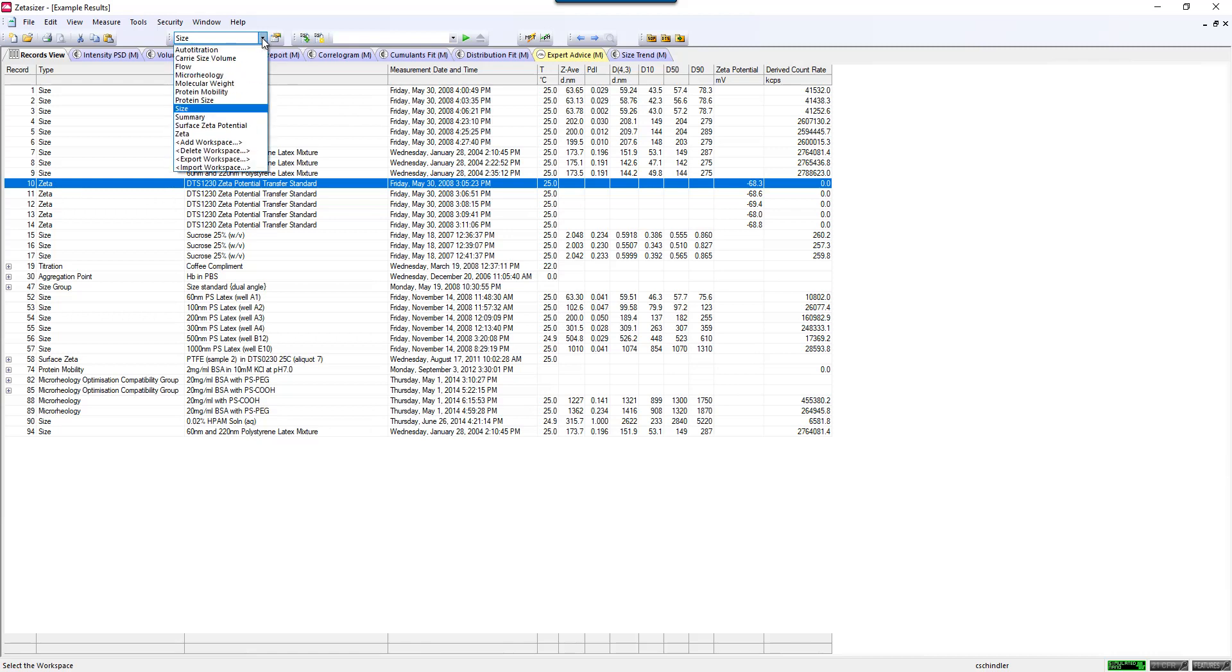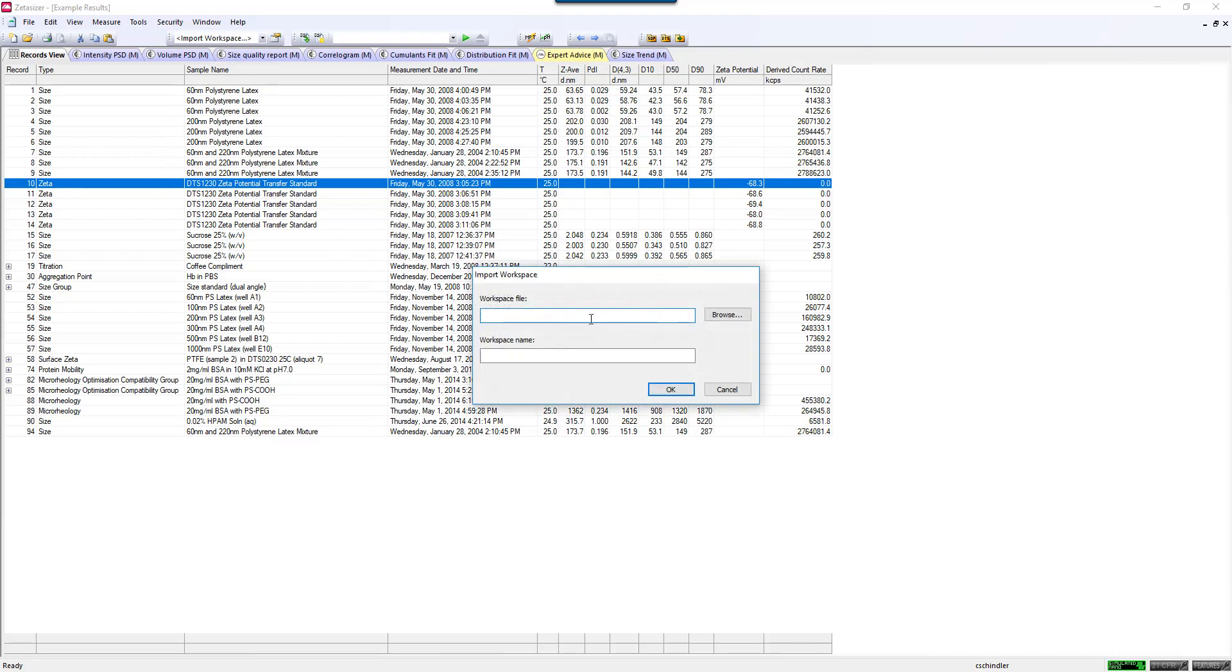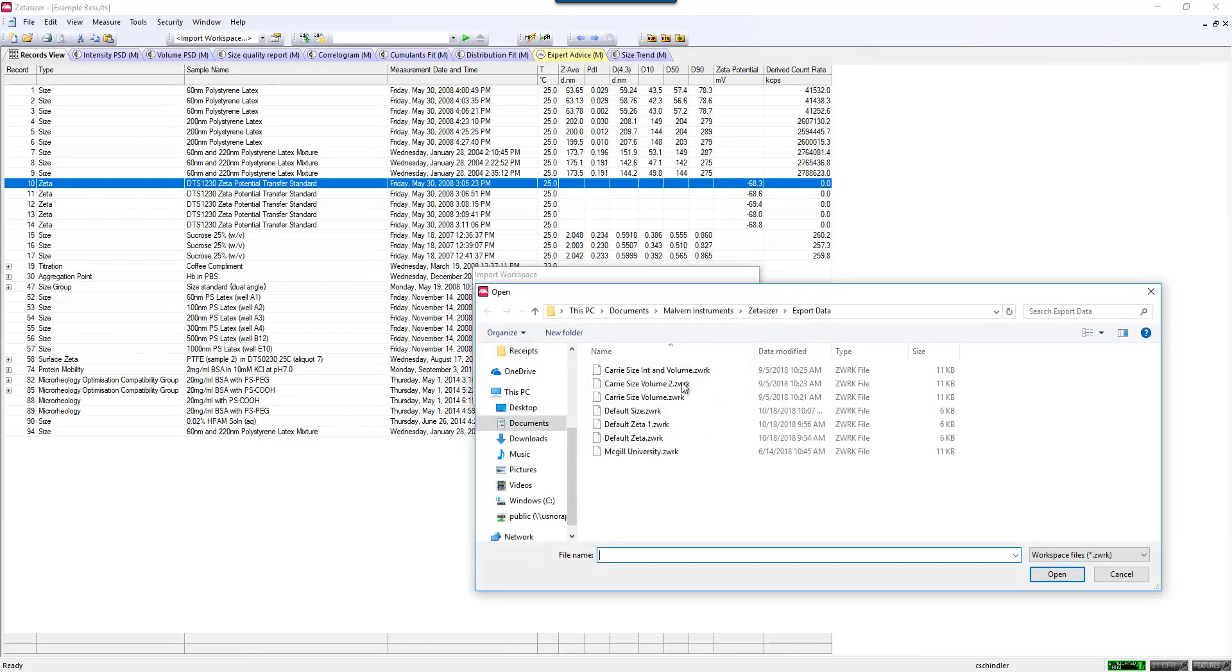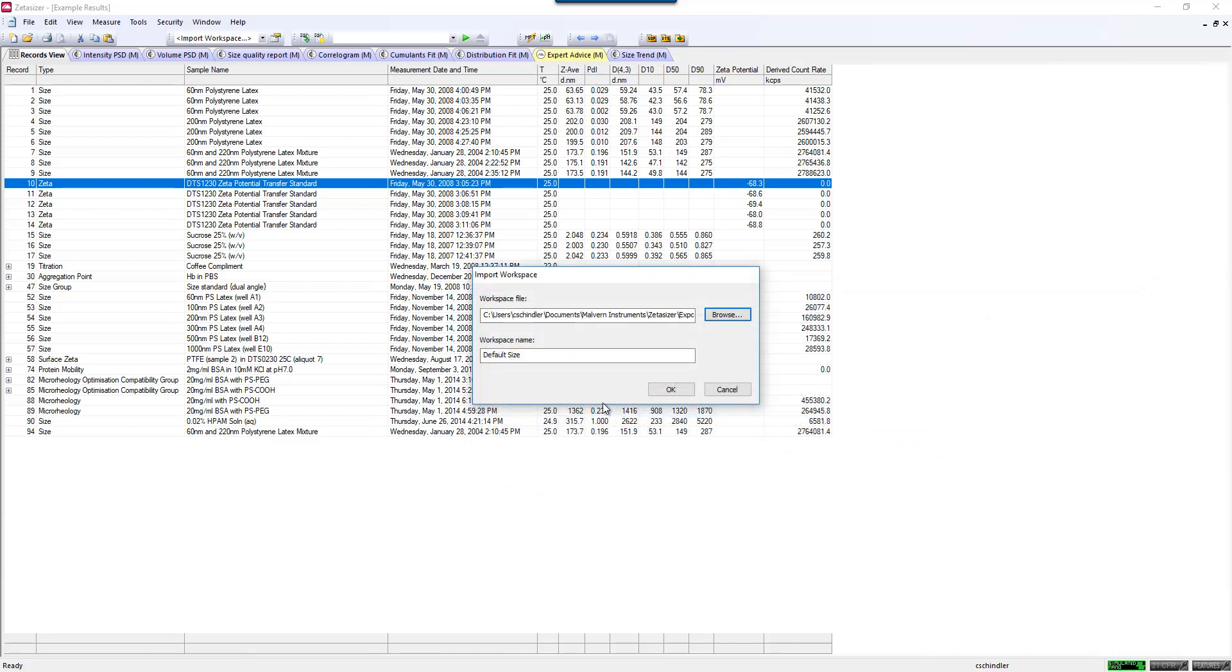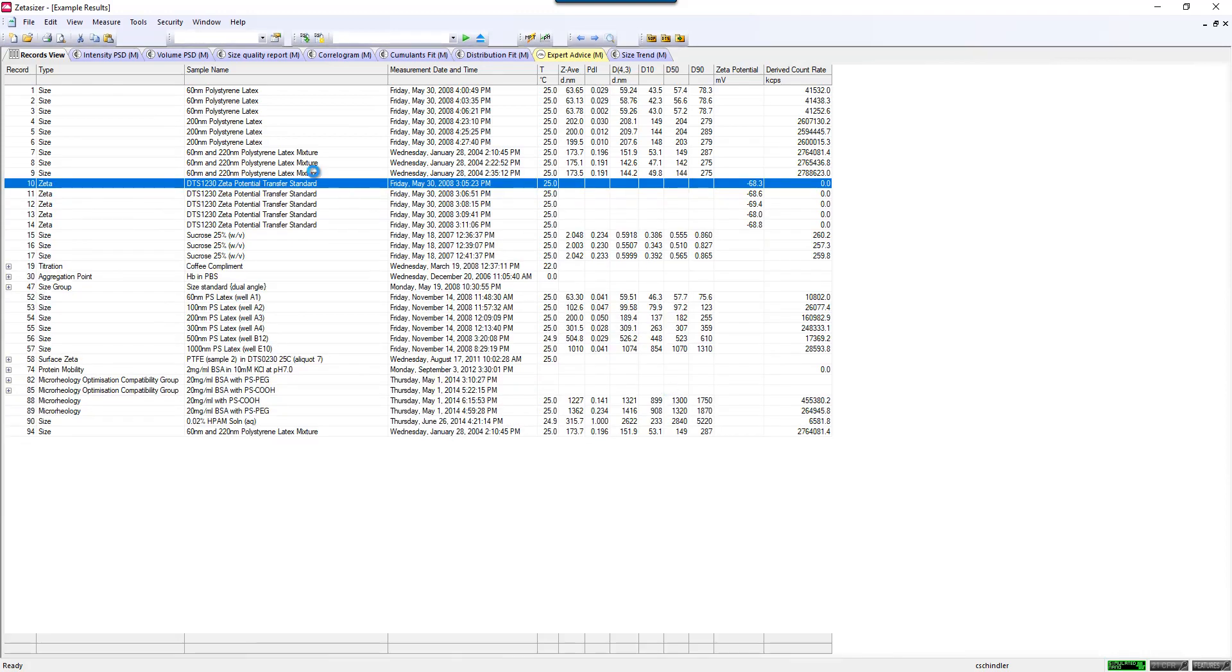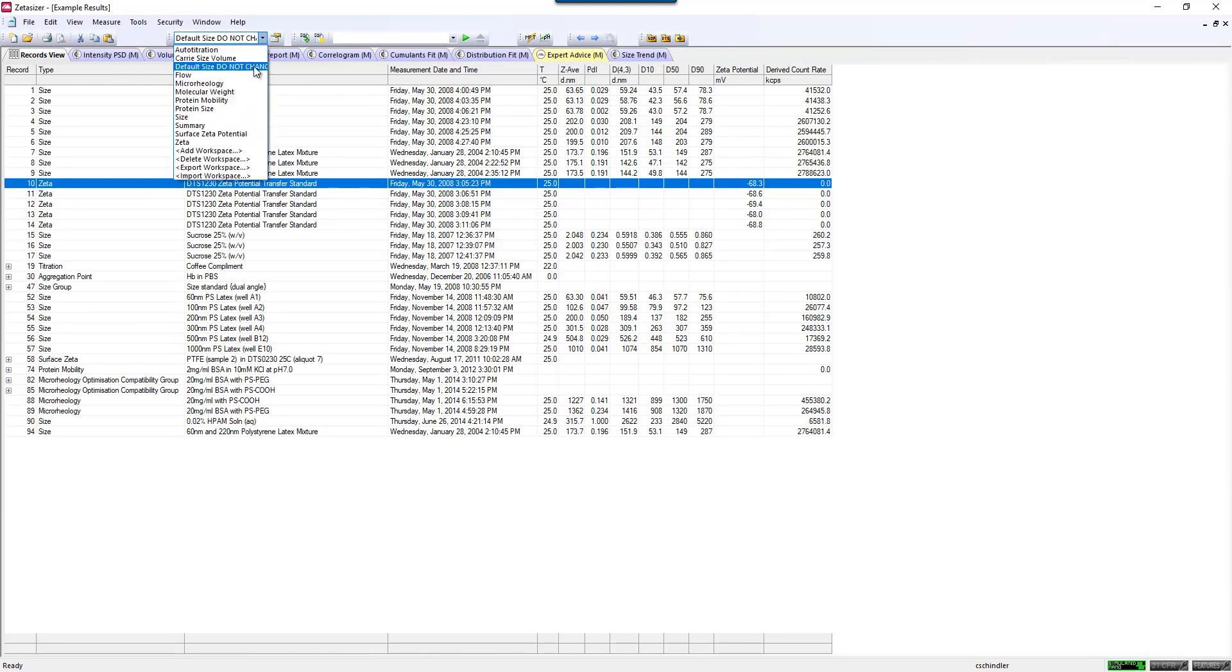What this also does is if I want to put that back in the software, I need to import that workspace and find where I've saved that, and give that its workspace name. So this is default size, do not change, or something like that if you have multiple users. Now you'll see here's the default size and it says do not change next to it, so that if you have multiple users they wouldn't be changing things about this particular one. But if they did, you could always go back to that original one that's still the default one.